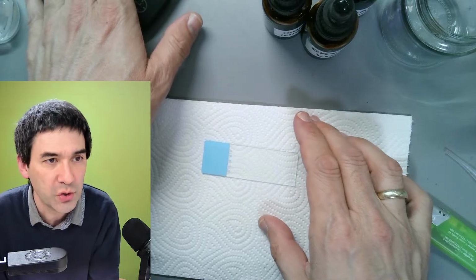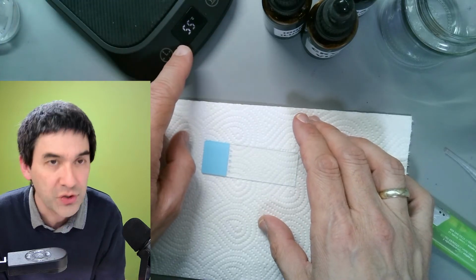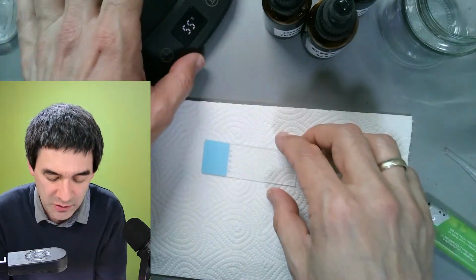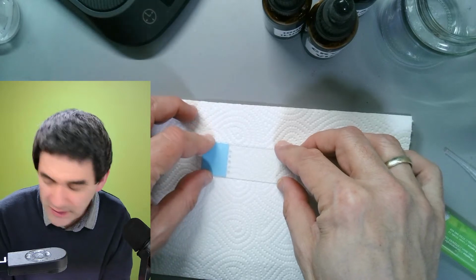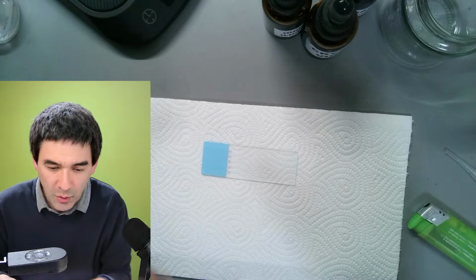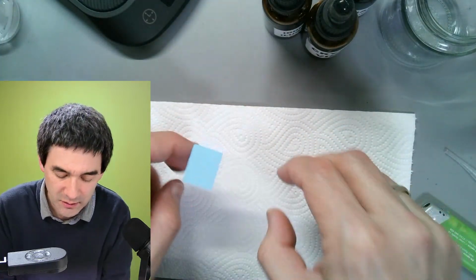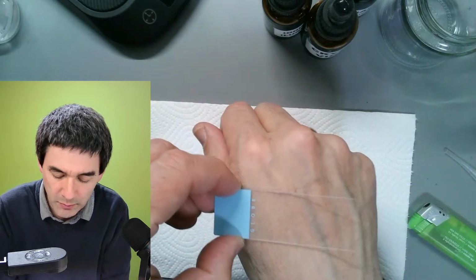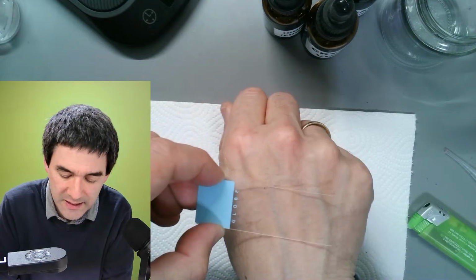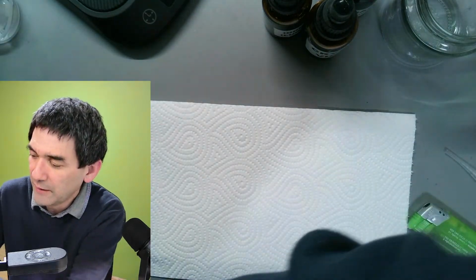So my only concern now is I hope that this 55 degrees that I had was not too hot, because if it's too hot, then the cells will actually pop open, right? And I don't want that. But what we can do now, just before we do the actual staining, is have a look under the microscope in any case. Yeah, why not have a look? It's still kind of warm. It's kind of surprising how long the glass slide is able to keep the temperature. So that's fine. So let's quickly have a look here.